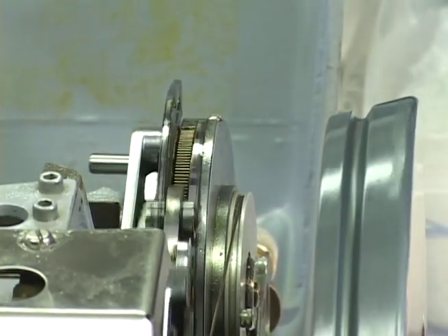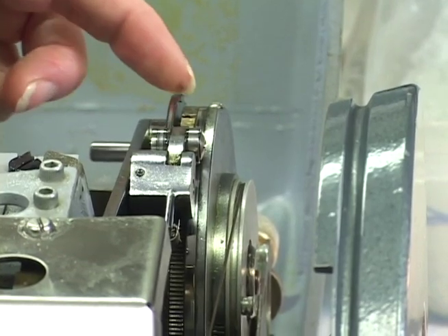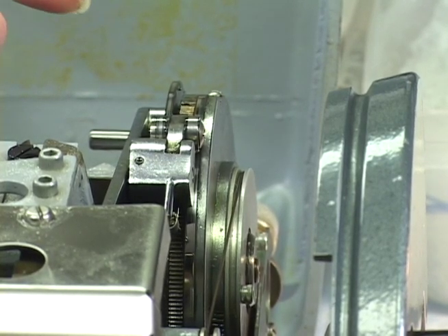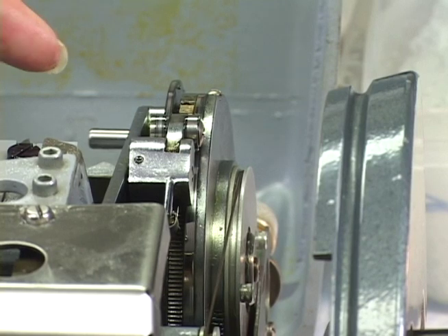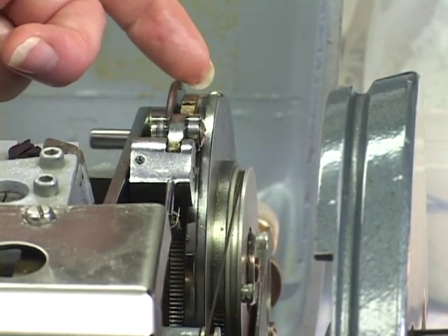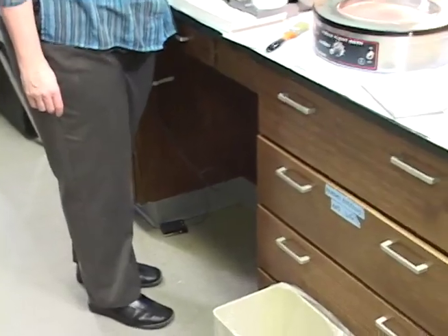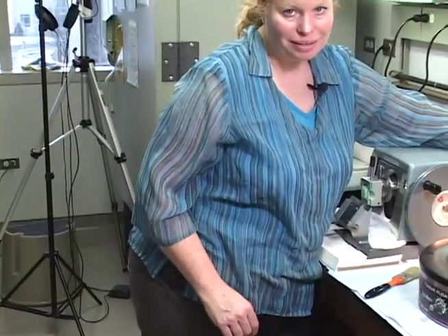So when you turn this handle, this thing comes around and it'll push 1, 2, 3, 4, 5, whatever you have it set at, past that number representing each micron, and you can actually watch it push past there and count those teeth as it pushes and see that it's cutting accurately at that micron level. And that's a good way to gauge it. Now, if it ever came out of alignment or the screw loosened or whatever, the mechanic or the equipment engineer that would fix this would adjust this to accurately reflect the micron number, so that it pushes that number of teeth forward. This is kind of a neat way to tell that it is accurately cutting at the micron level that you're requiring. It's kind of overkill, but it's kind of fun to know that information.